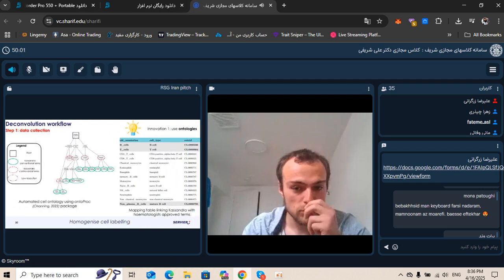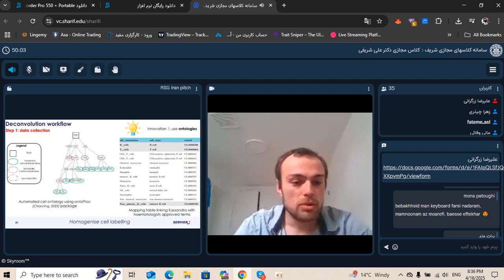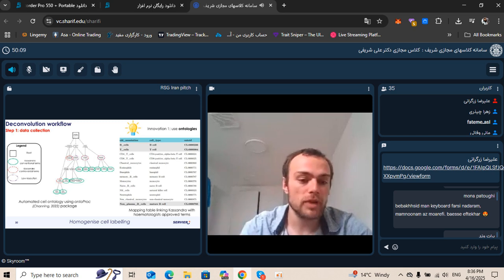So I won't really go further in this task because it's mostly data management, but I will just add two innovations that I partly contributed. The first contribution is that I consider cell ontologies to homogenize the nomenclature of my cell populations using the package ontoProc.